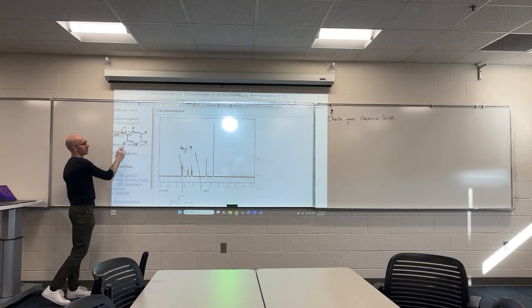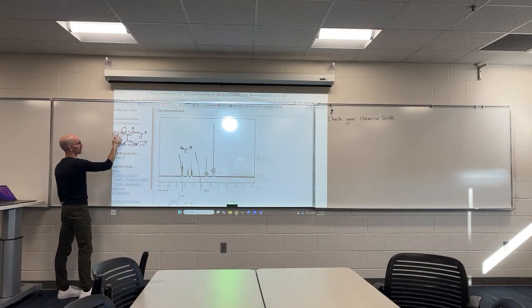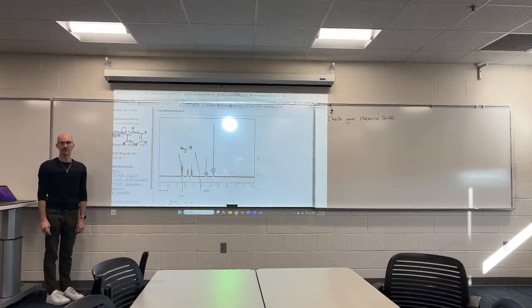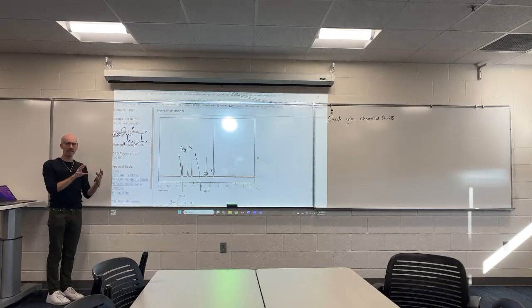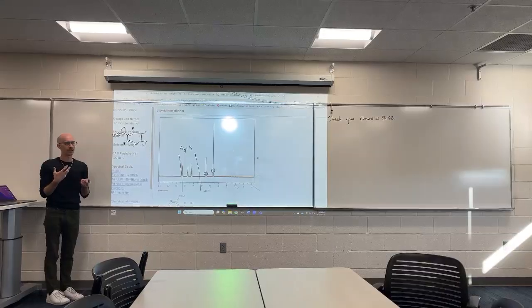And then these 2 hydrogens, I said, would probably be on the far end of the functional group adjacent, maybe even beyond it. And I see something there. And we said that the hydrogen of the alcohol should be in maybe a similar region. So right now, I can't, with any certainty, tell you which of those signals belongs to which. That's not what we're looking at right now. We're just considering how the chemical shift tells us something about the bonding nature that those hydrogens are in.